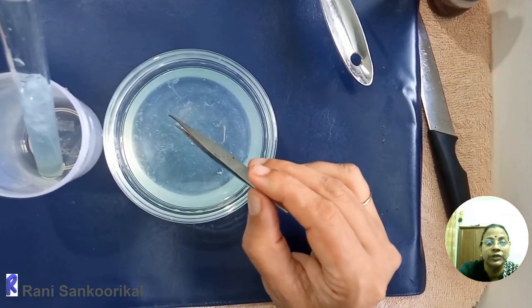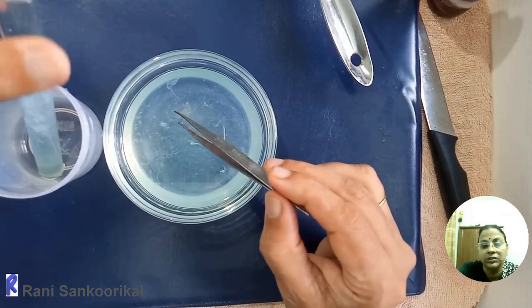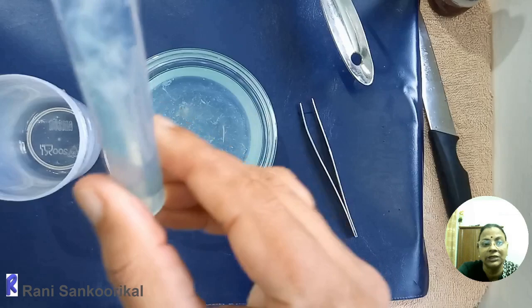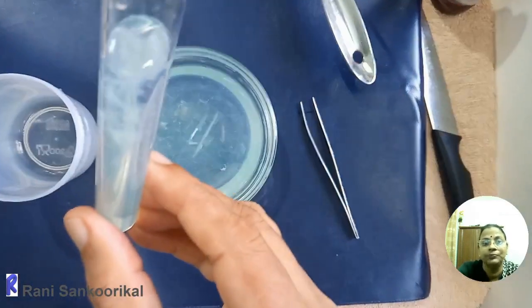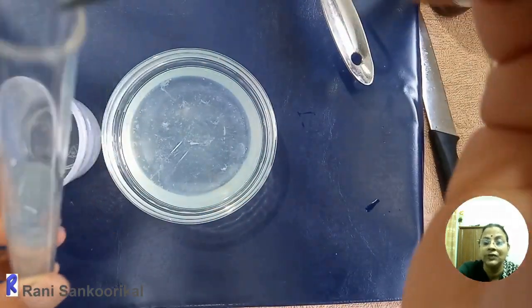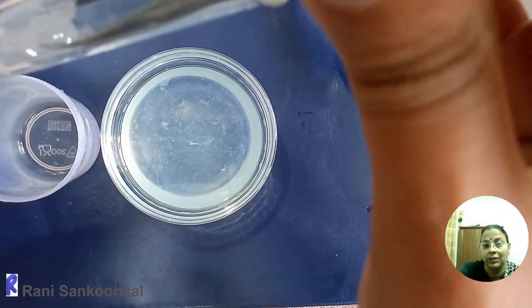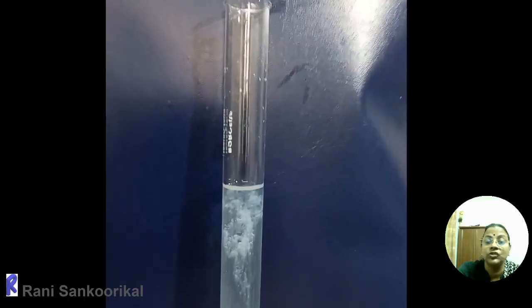Then after 5 minutes, when you observe, we can see a cloudy appearance on top of this solution. Here in the petri dish, it is not that clear because the density of the solution is not clear. But I will show you how it is separated in the test tube by keeping a darker background. Now you can observe a white strandy appearance on the top of the solution. When you keep the test tube against a darker background, you can see the strands of DNA very clearly.